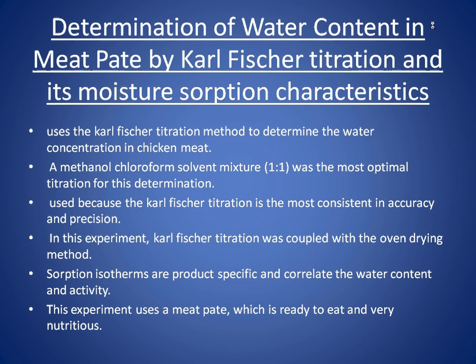Water concentration in food is a popular analysis for the food industry because its water concentration can affect characteristics of the food. Though other methods are applied for this analysis, Karl Fischer titration is the most consistent in accuracy and precision. In this experiment, Karl Fischer titration was coupled with the oven dry method.